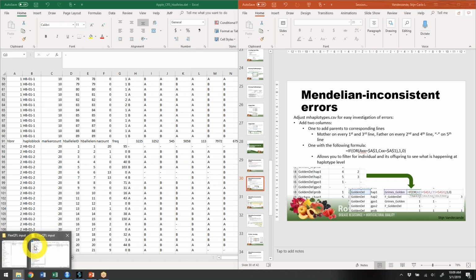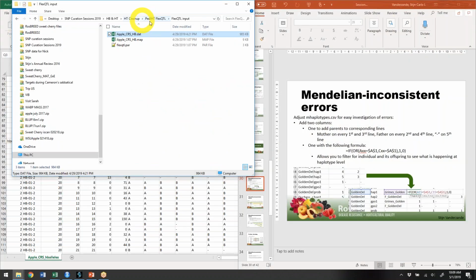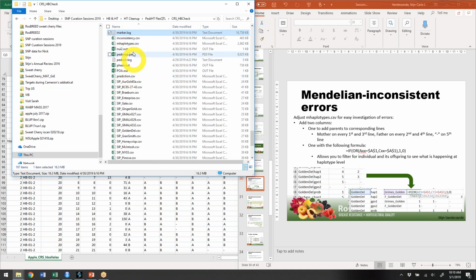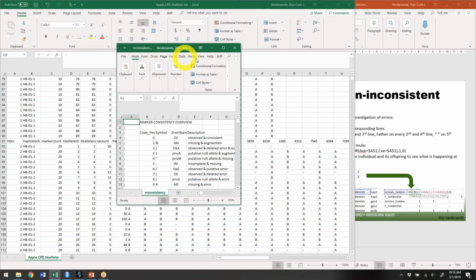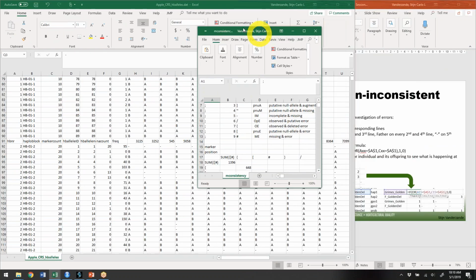And I think I have a file here that was run, and in the end, I think this one for some reason took almost a day, which normally doesn't take this long, but I was able to get one run in, and you can see there's again a lot of errors. So you might be taken aback a bit by these errors, but I can tell you that a lot of these are very easy to solve.